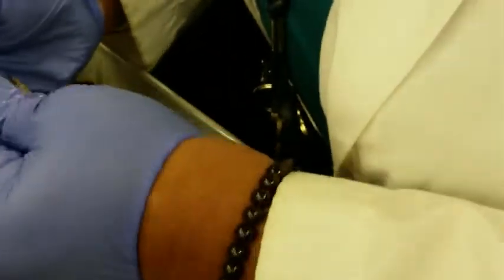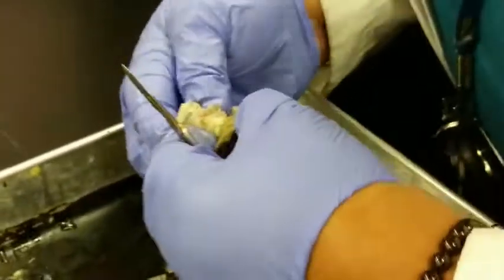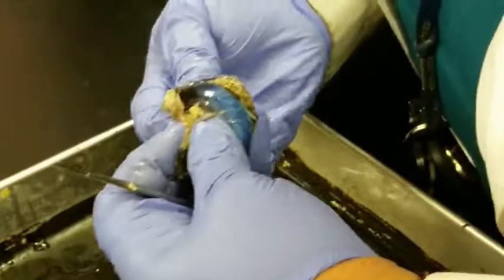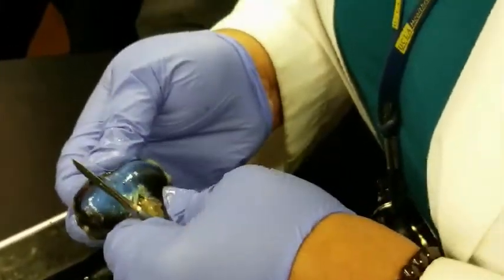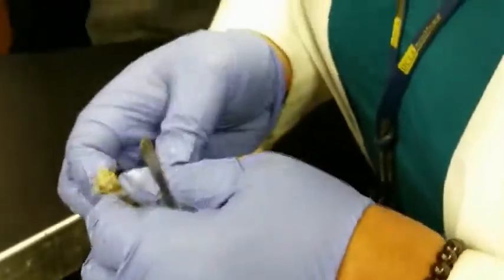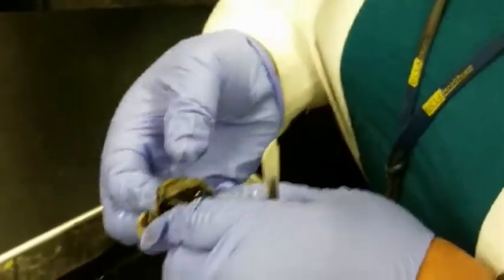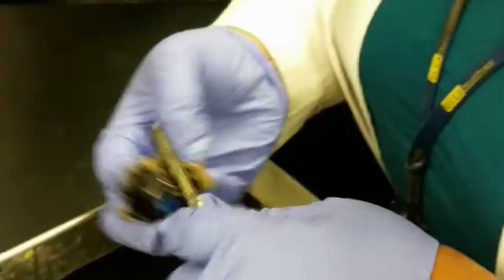All of the vitreous humor, jelly-like substance. Beautiful ciliary body. You can't see the suspensory ligament because it should be white. It's all broken. It suspends the lens.